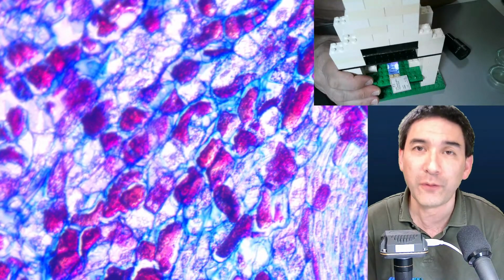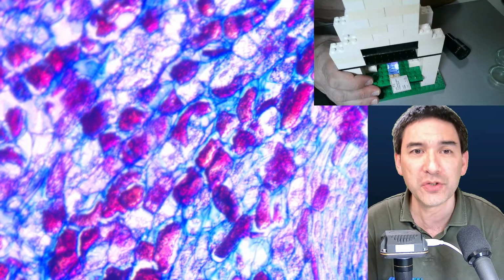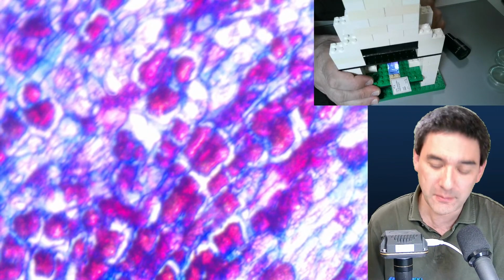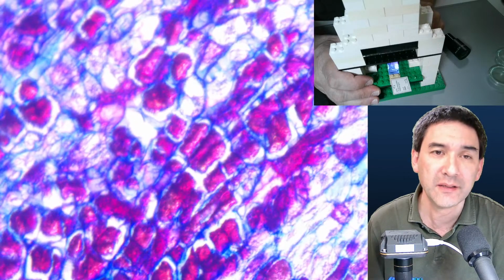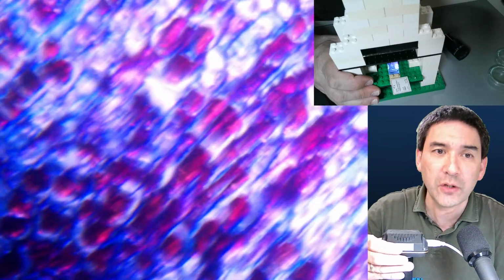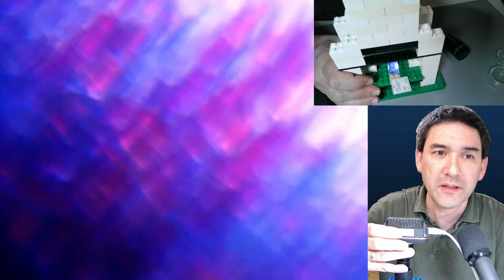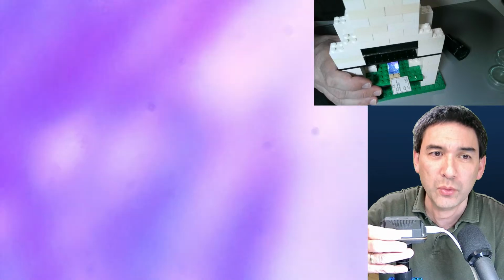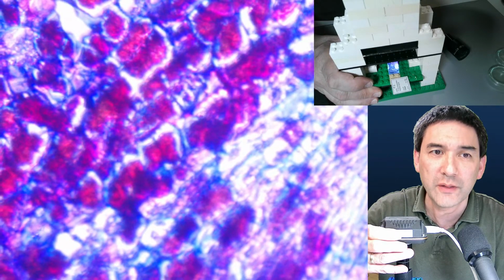Well, the thing is the following. Yes, it is possible, by changing the distance between the slide and the specimen. If you change the distance here, you can actually also move it further away. It's going to be difficult, and the image is going to be a little bit blurry, but then you have to move the slide up to get the correct focus again.